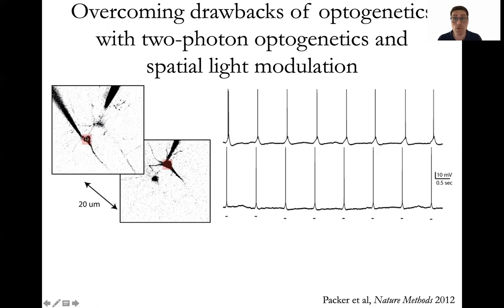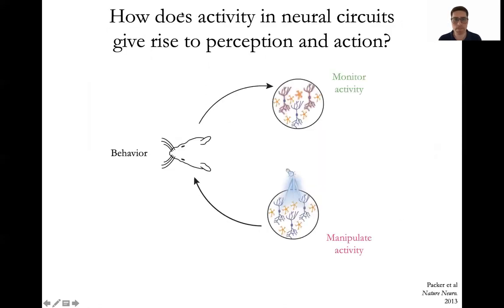We've scanned our two-photon excitation capable laser over each one simultaneously. And you can see in the electrophysiological recordings from each one of these neurons, obtained via these patch clamp pipettes shown here, that each one of them spiked when we turned the light on. So we were able to activate these neurons without activating other neurons nearby. So if we move these spots of light off these cells, for example, we see that they're not activated, showing the specificity of this sort of approach to overcome some of the drawbacks of optogenetics.